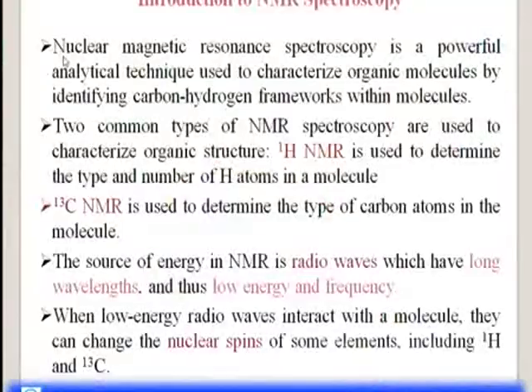And we have discussed nuclear magnetic resonance. It is a powerful technique which helps us characterize and identify the carbon as well as hydrogen framework within the molecule. We have said this in earlier slides also. The two more common NMR spectroscopies are 1H NMR and 13C NMR, because 12C is inactive towards NMR, right?